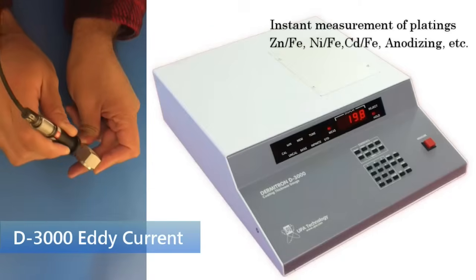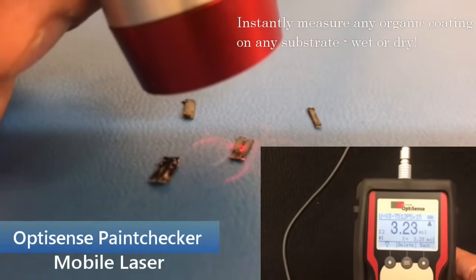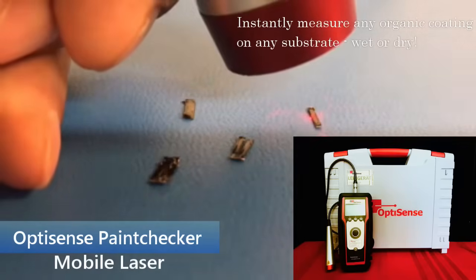UPA Technology is a customer service focused company, providing technical assistance for all questions and processes by phone or by email. As a worldwide supplier of coating thickness measuring equipment for more than 40 years, we have expansive knowledge of virtually all measuring technologies that are in use today.